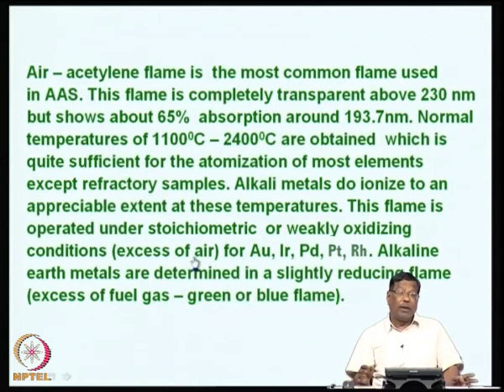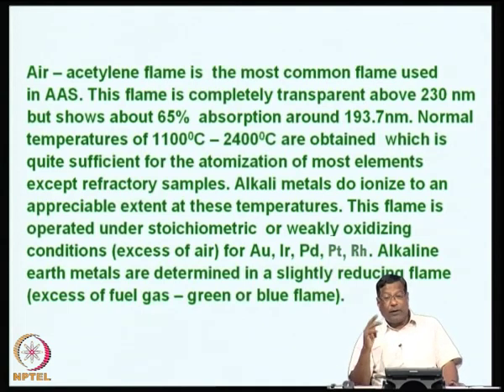That means, when you use gas, you will get two types of fire, when you use oxidizing conditions more or reducing conditions more. When you get oxidizing conditions, you are using more air and less fuel. So, the flame will be burning with a reddish tinge, and when you use excess fuel and less air, there is not enough oxidation.